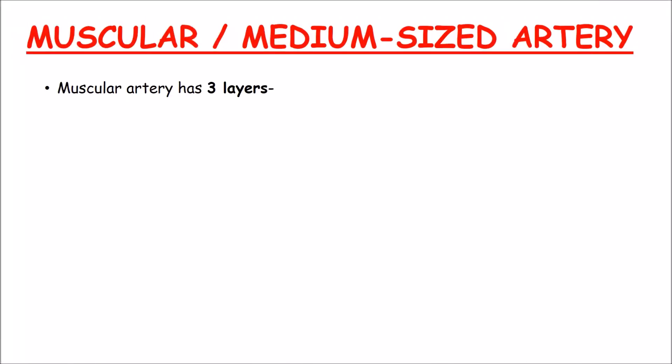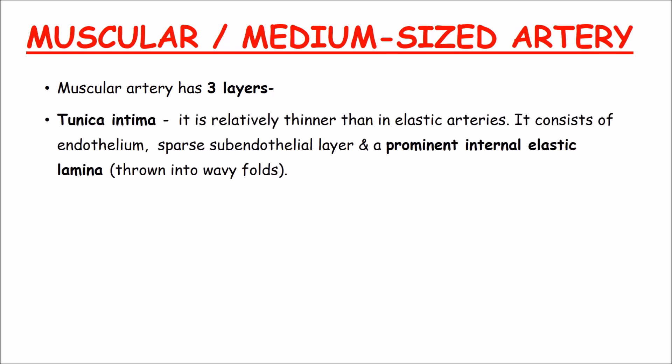Muscular or medium-sized artery also has three layers. The tunica intima is relatively thinner than in elastic arteries. It consists of endothelium, a sparse subendothelial layer, and a prominent internal elastic lamina which is thrown into wavy folds.